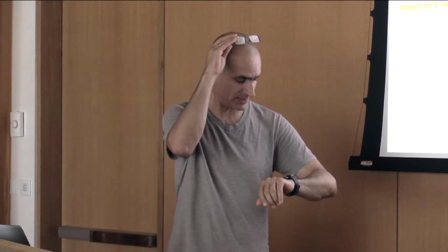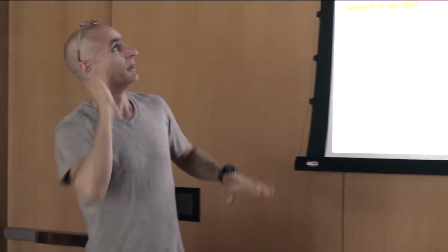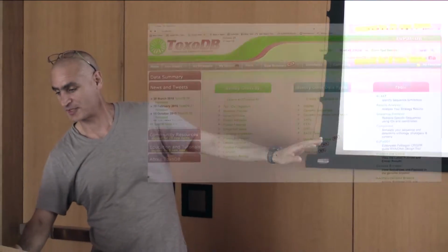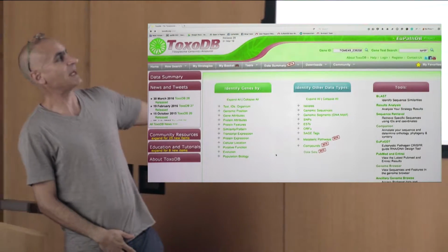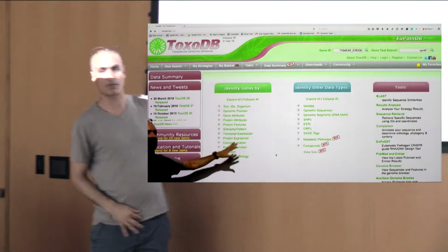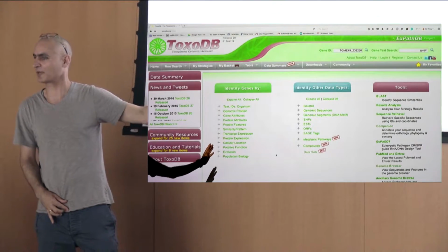Okay, so now getting back to the database, and let's make sure I'm doing this on time. Yeah. So this is one of the databases, toxodb.org. From just looking, there are lots of options, lots of things you can click on. So don't worry about getting bogged down by it.